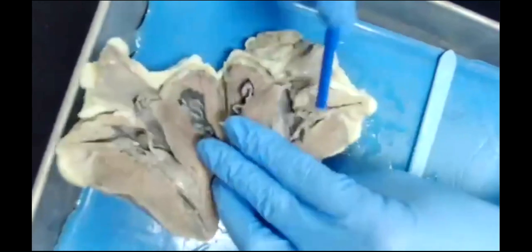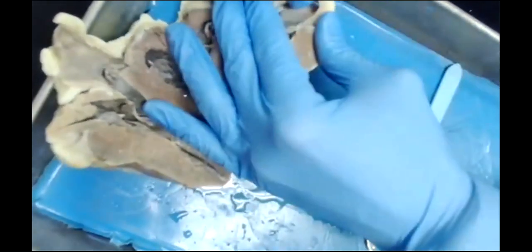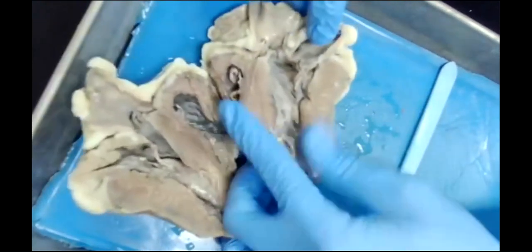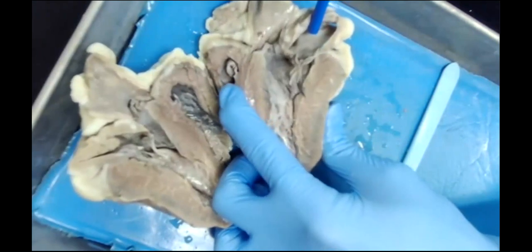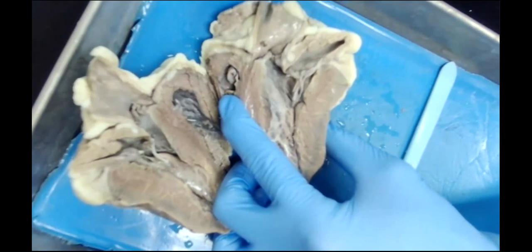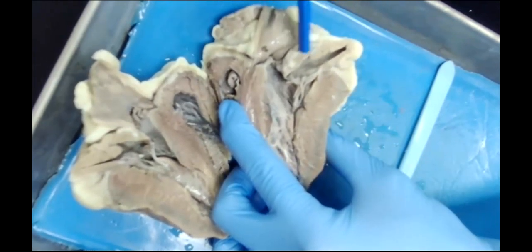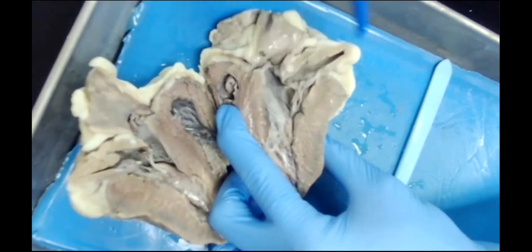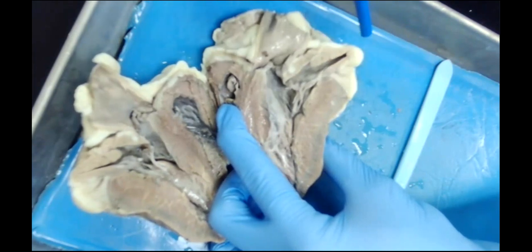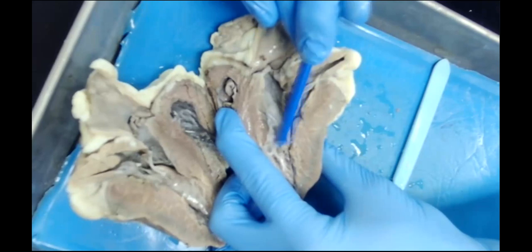Here, you see it a little better on this side. So this is our left atrium. Now remember that the atria are basically going to be like little primer pumps. These are going to kind of have blood drain straight through them in some cases. So blood will just basically flow directly out of the superior and inferior vena cavas and fall straight into and start filling the ventricles, or in this case, because it's the left side, where they'd be coming out of the pulmonary veins and just kind of falling straight down into the ventricle.